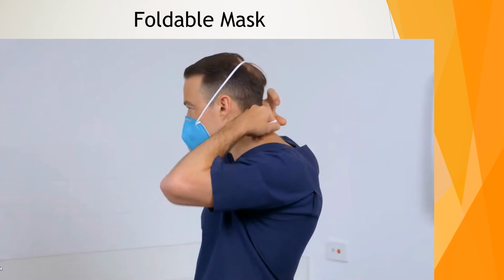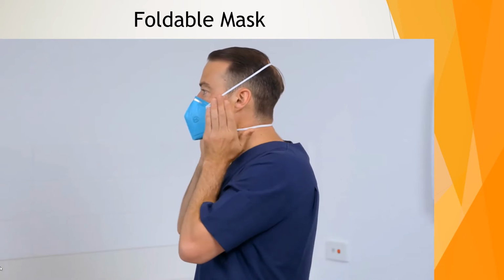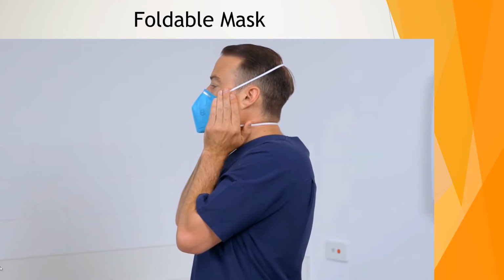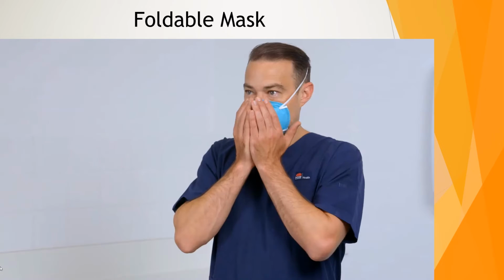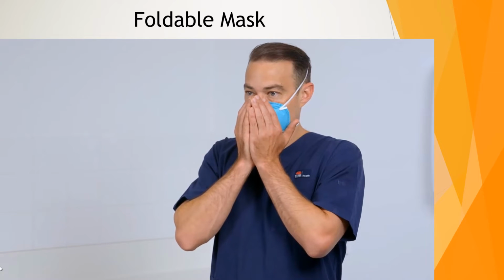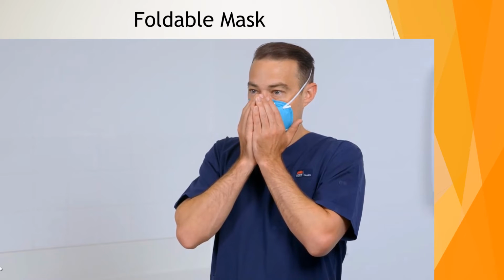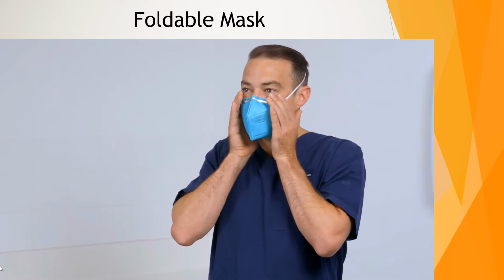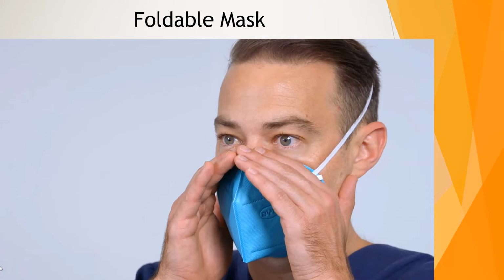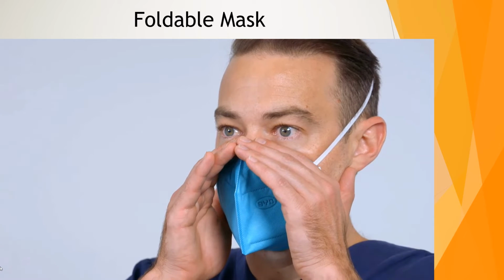This type of respirator requires close attention to the process of fit checking. To fit check an N95 foldable respirator, place both hands over the respirator, taking care not to disturb its fit. Gently place hands around the edge to feel any air escaping when the fit check is assessed. Take a deep breath and hold your breath for a few seconds, making sure the respirator collapses inward as you inhale. Then exhale.